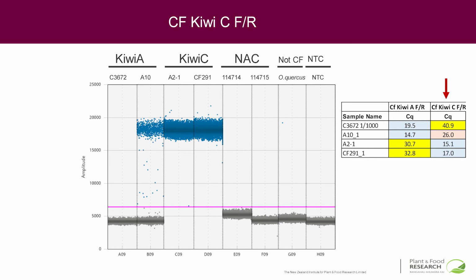Now, what we think is happening here is, it could be that this is actually a mixed culture, but what we actually know with Ceratocystis is that there's a lot of heterogeneity in the sequence. With this target gene, which is the ITS, this particular region, it has quite a number of copies within the genome. Normally, these sort of homogenize out and they become pretty much the same. But occasionally, and it's certainly been reported quite often in Ceratocystis, there's this heterogeneity happening, which may be either horizontal gene transfer or just genetic change which hasn't actually gone through that homogenization process.